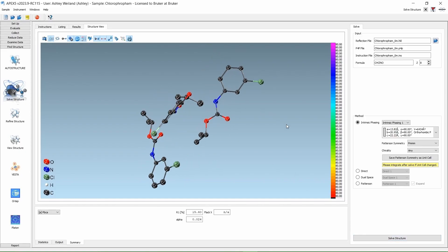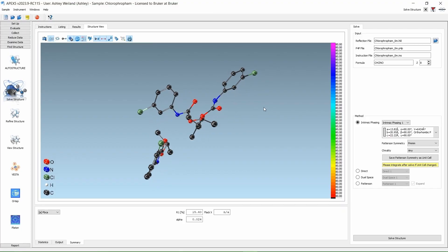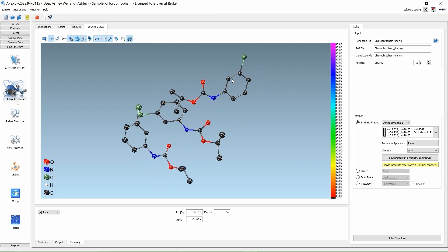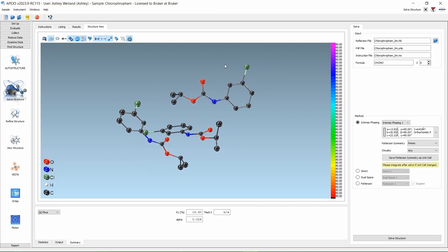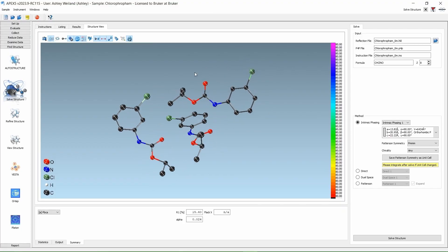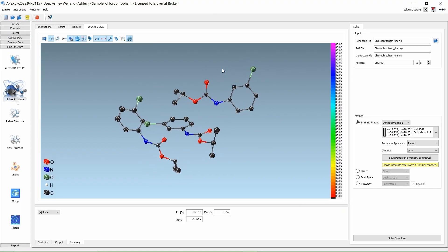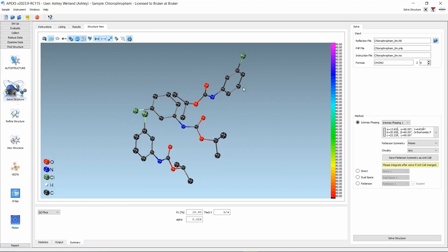The solution is in the PBCA space group. Sometimes you will get a couple space group options, and you can toggle between them using this drop-down menu. Let's go refine this data. Click on Refine Structure.